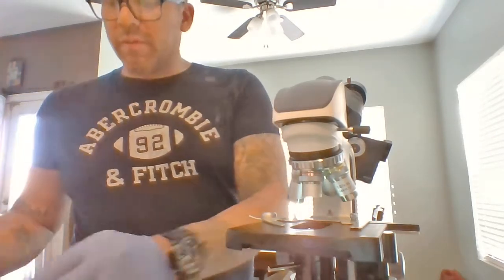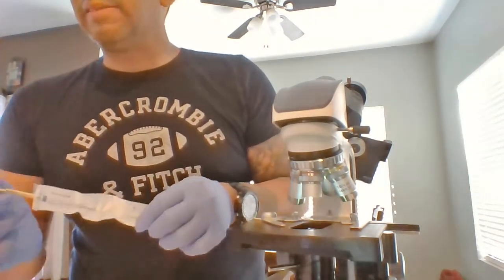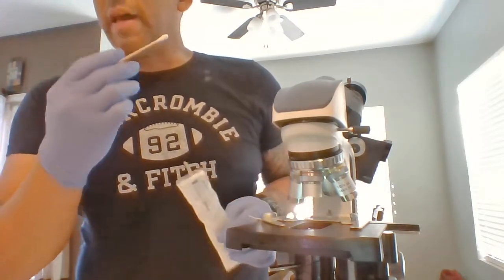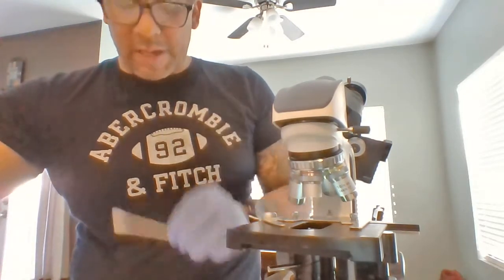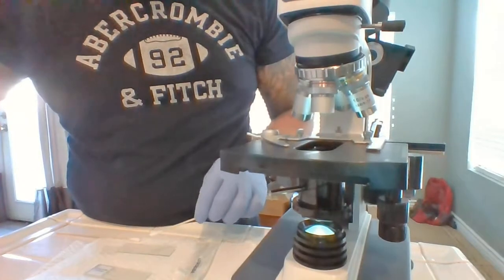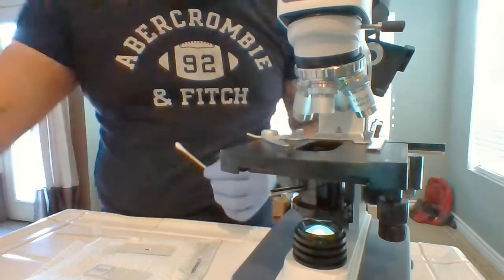So I'm going to start by swabbing the inside of my mouth, my cheek. Gently swab the cheek, and now I'm going to add a drop of distilled water using the pipette. I'm going to smear the sample all over the slide here. So I'm going to smear it on the slide, grab a drop of water, and put it on the slide.